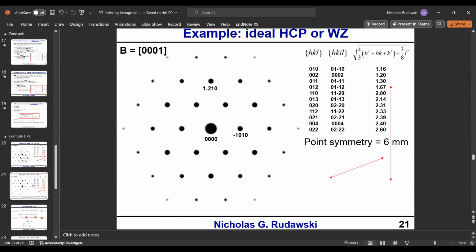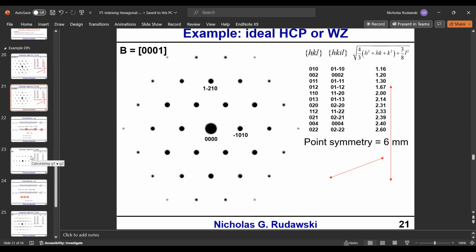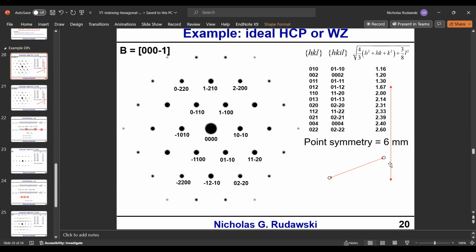So we're going to kick it up a little bit and go on to the next one, one of what I call the big three in terms of the hexagonal lattices. That's this one right here. Let me grab these lovely arrows again.